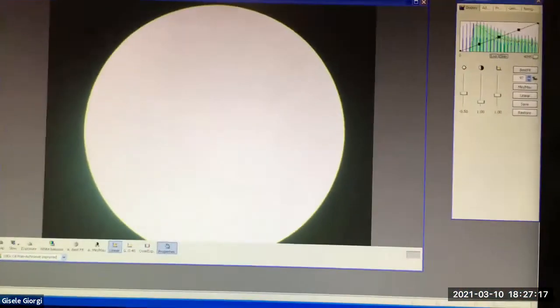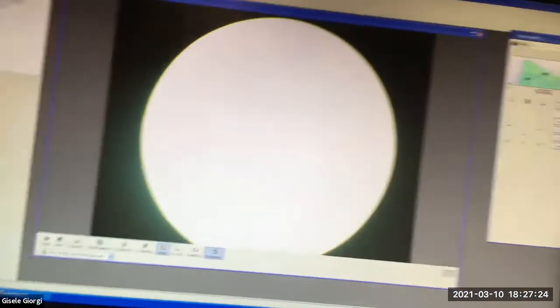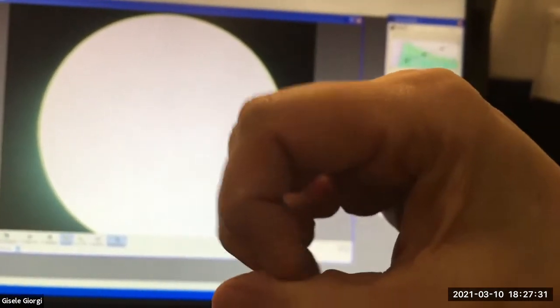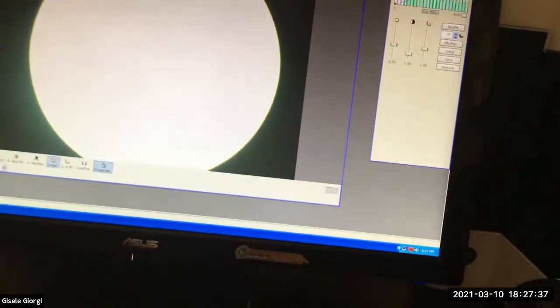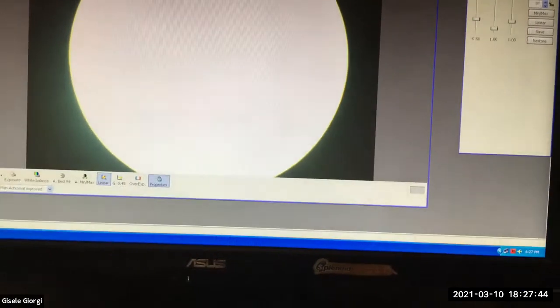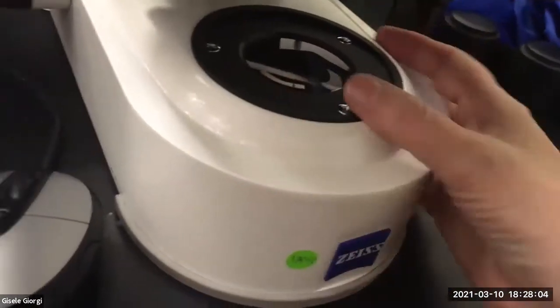What I wanted to show you, I know on the Meijis it does this. I haven't Koehlered this scope in a long time. What you should be able to do is open this so that you can't see it, like you're looking in your oculars and it's touching your edge of your field of view, and then you just go just past. And then you've Koehlered it. So that's it for, there's a little last part, but this is really the main thing that you're going to need to do on your scopes. If you put a slide on and it looks really weird, you just want to know how to do this. So Koehlering, again, you stop down the field stop, which on your Meiji scopes is going to be right here on this scope.